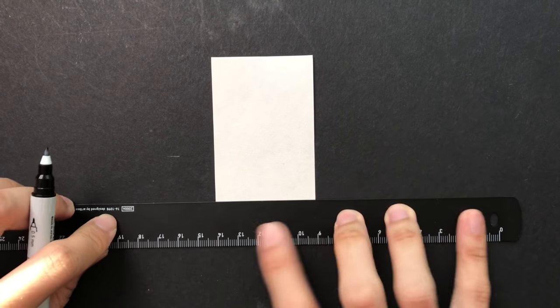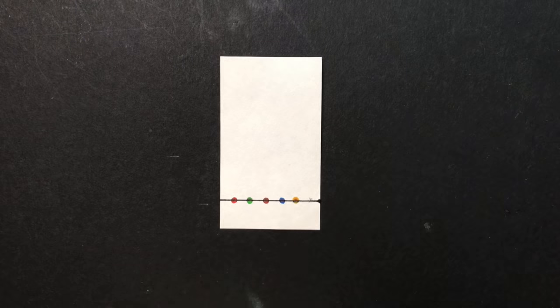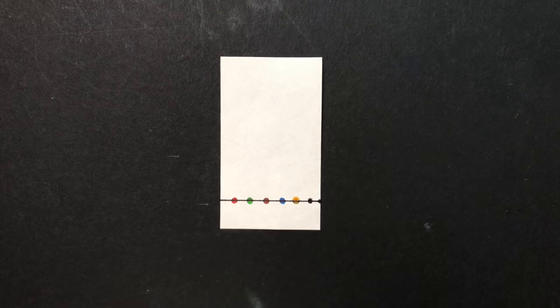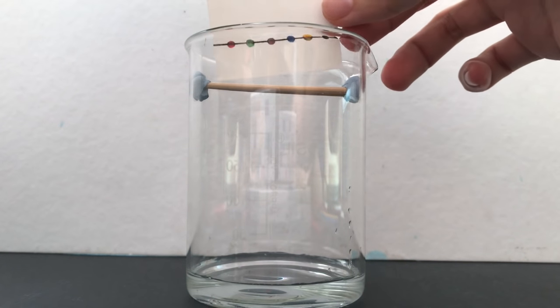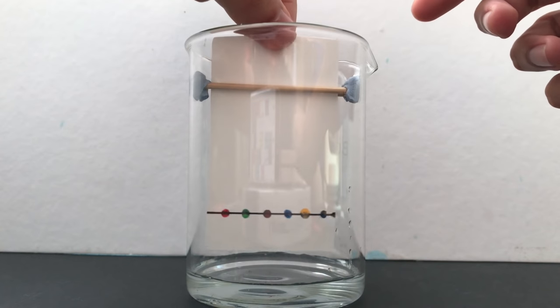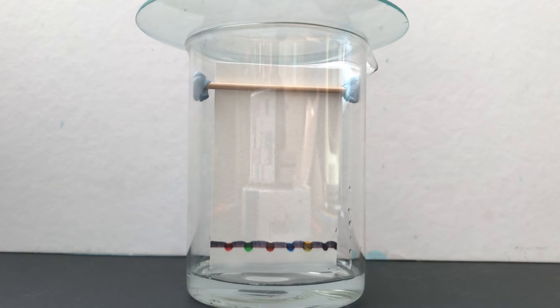Now let us repeat the experiment, but this time let's take a look at what would be the outcome if we had drawn the start line using ink instead of pencil. We can see that the ink, being soluble in the solvent as well, will also rise up the chromatogram and complicate the results.